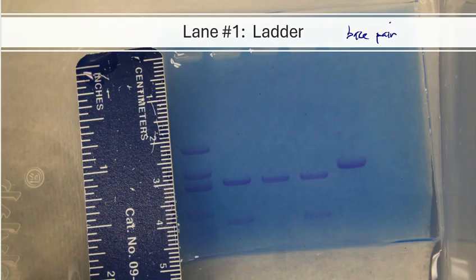In order to do something with those numbers, we need the distance of how far they've traveled. So what this means is that up here at the very top, this is where I've injected a sample, and the sample has migrated down the gel closer to that red cable, and then this particular piece stopped right there. So this gives me an idea that that piece, whatever it is, is probably larger than the rest of them. And the larger ones move slower. That's how I know that compared to all of the other bands that show up on the gel, this one is the largest because that one moved the slowest. That one was more toward the top of the gel itself, okay?